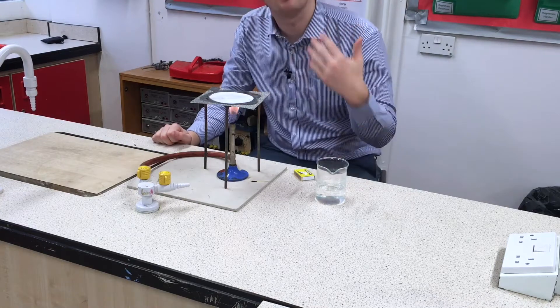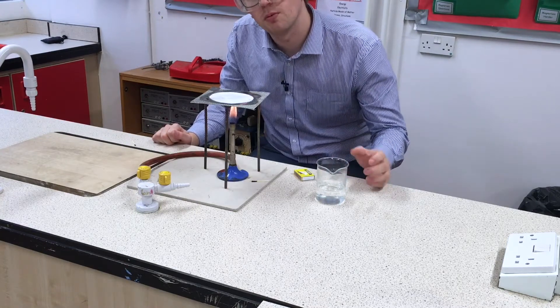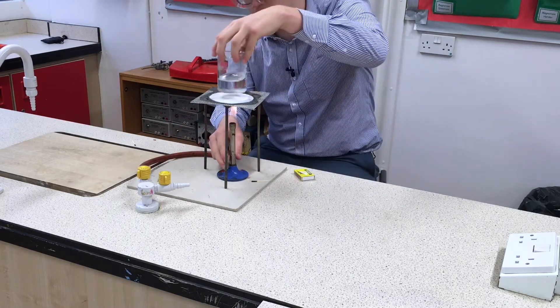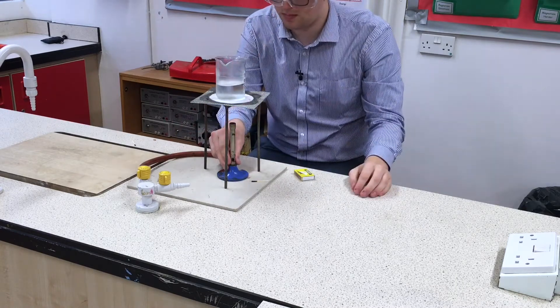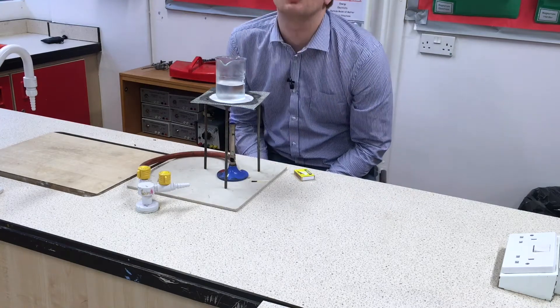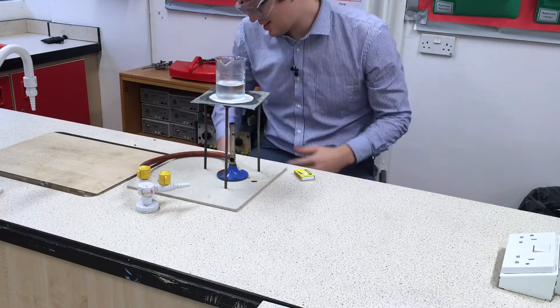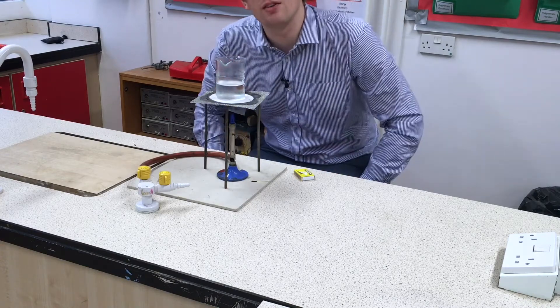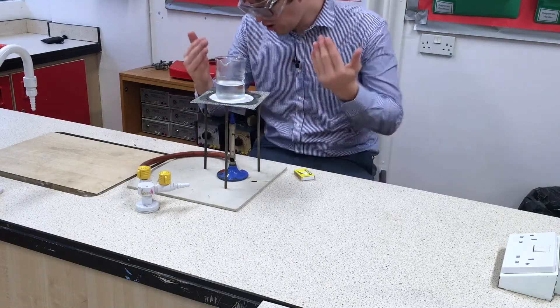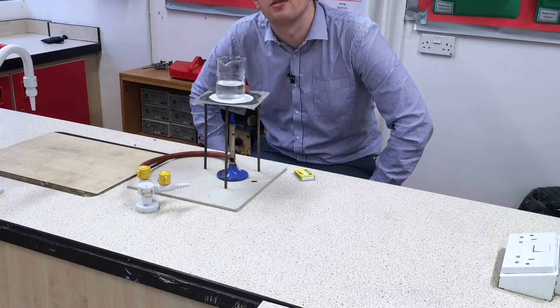Now I've got my Bunsen burner lit, I'm going to turn it to a roaring blue flame and put the beaker of water on top. I'm now going to bring this water up to a nice rolling boil. I'm also going to step away from the stool, just in case something goes wrong and I don't get boiling water on my lap, which wouldn't be nice at all.